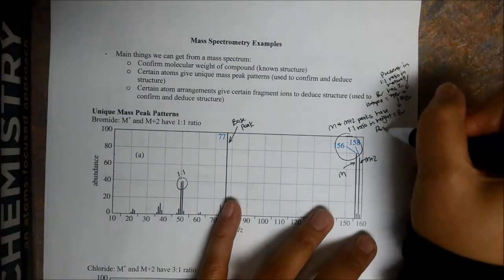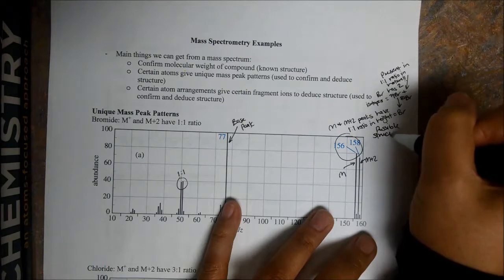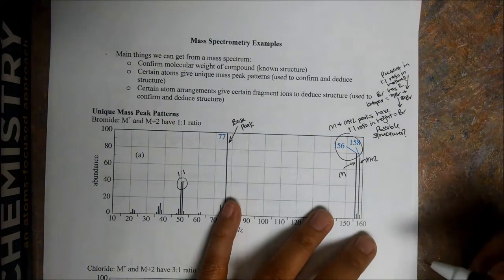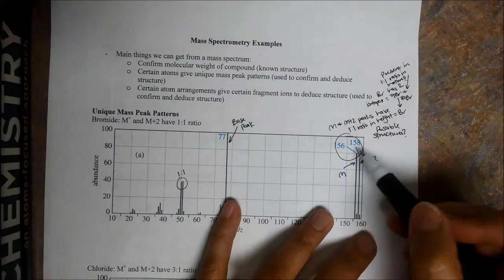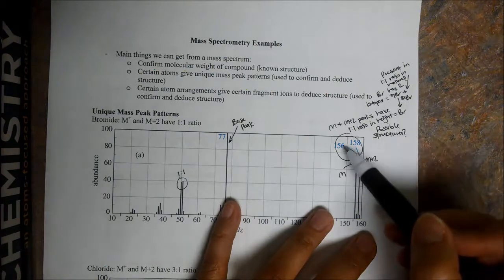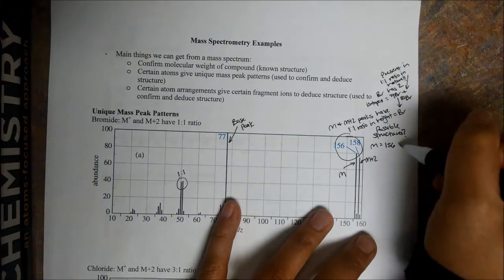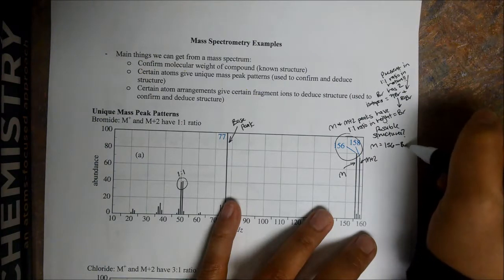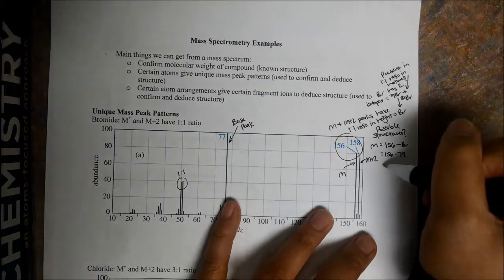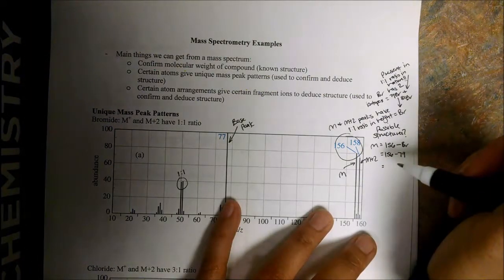What are some possible structures of this compound? Let's think about it and see what we can deduce. If we know we have a bromine, bromine has two masses, 79 or 81. So let's take the lower one. M equals 156 minus the bromine, which is 156 minus 79, and we get 77.